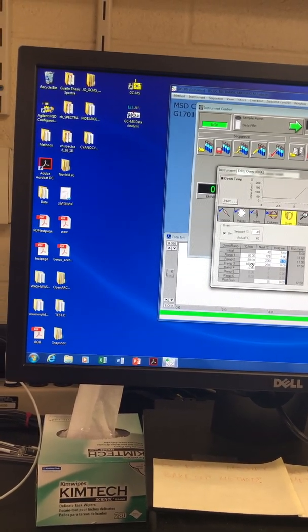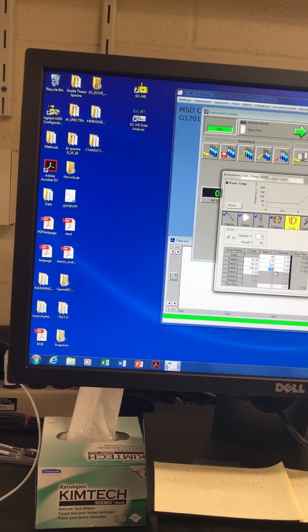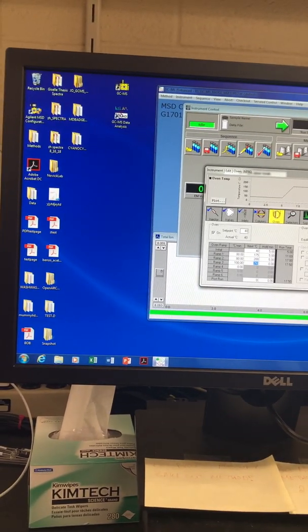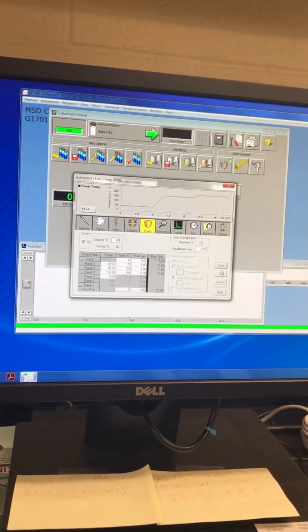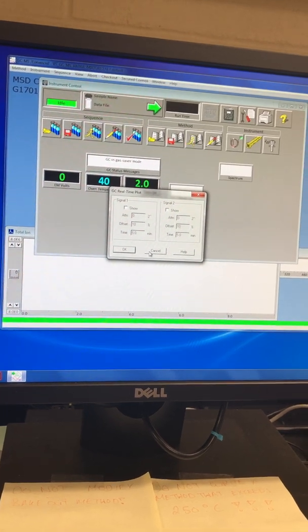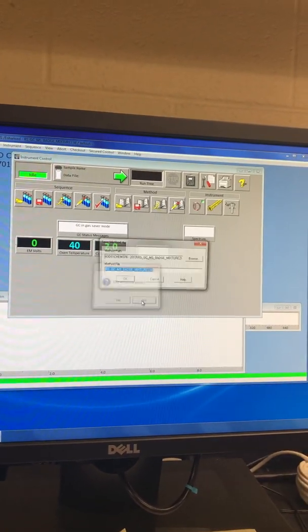So then I can increase the ramp rate to about 100 degrees Celsius per minute, since everything else should come off the column, and the maximum temperature would be 250 degrees Celsius, and you don't really have to hold that because there's nothing else to come off. So then you go ahead and click apply, and then click OK. This window will come up. What I just do is go ahead and click OK. And right here, actually click cancel. It doesn't really affect anything.